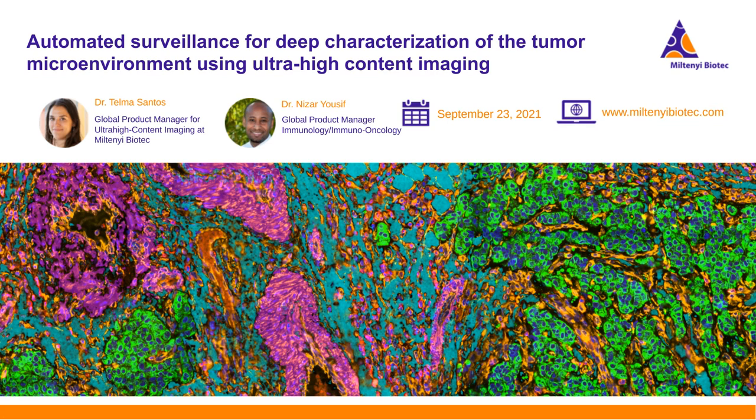But we have to say that the images are acquired always as a signal image, and we also acquire after signal erasure in every cycle. And when we process the images to stitch them together and to register everything, we also do a step where we remove the signal from the last erasure signal.